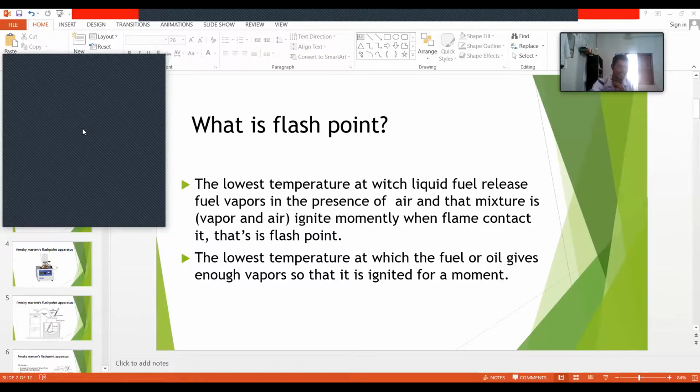So, same question. What is the fire point we found for the diesel sample in our practical? Not sure, sir, but I remember like 72. 70 something, right? 72. No. You are near that temperature. That's fine. That means you were there, right? You are listening. Okay, that's fine.